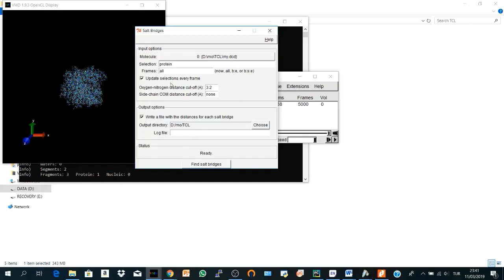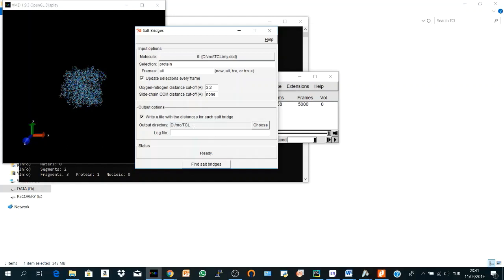VMD by default calculates the salt bridges within the default cutoff value which is 3.2 angstrom. So any interaction between positive or basic and acidic residues within this cutoff distance will be calculated. Here you will write a file with the distance for each salt bridge and here is the directory where my output will be saved and you are ready.